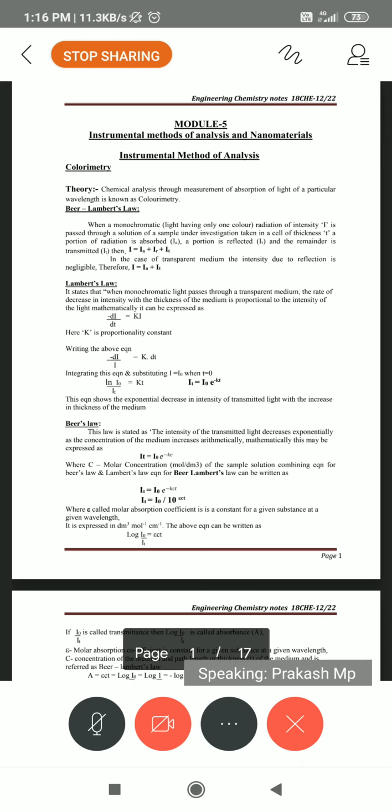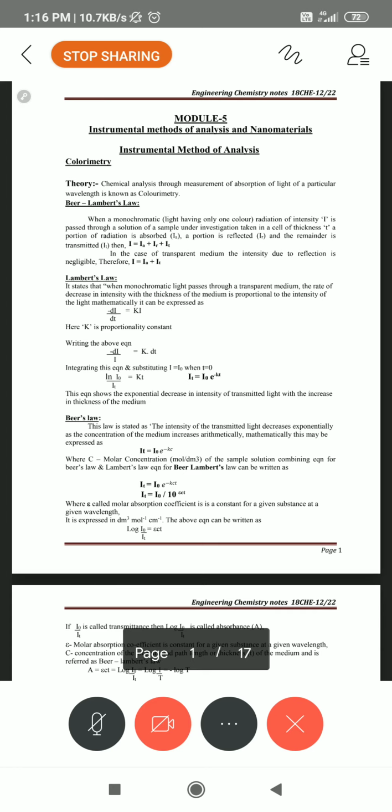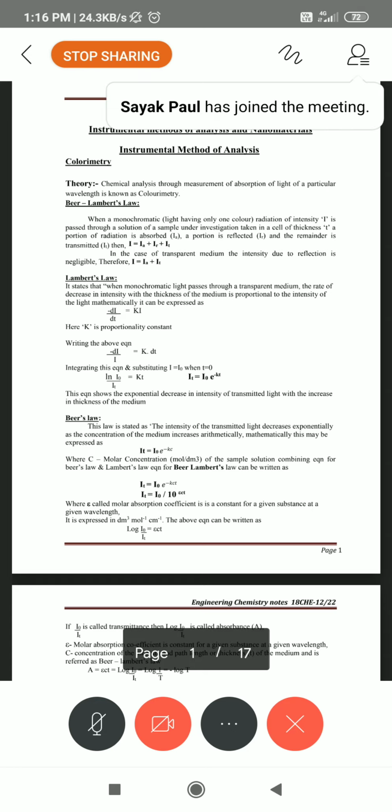In this, the first instruments we have used to estimate how much salt is there, how much solute is there. So this is also nothing but quantitative analysis. The instruments include atomic absorption and polarography, including fluorescence methods and polarographic methods.